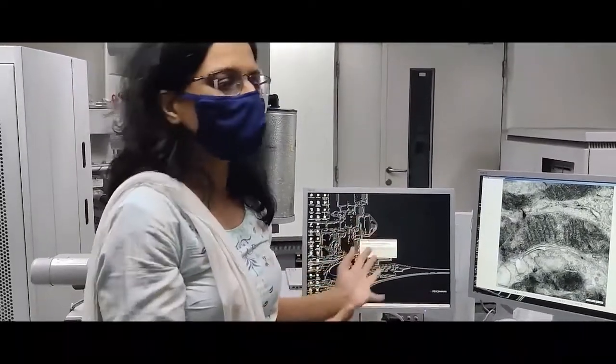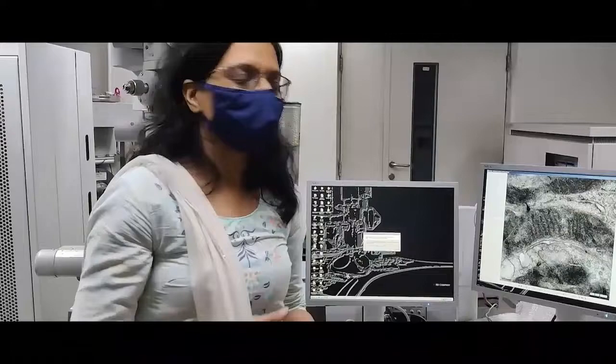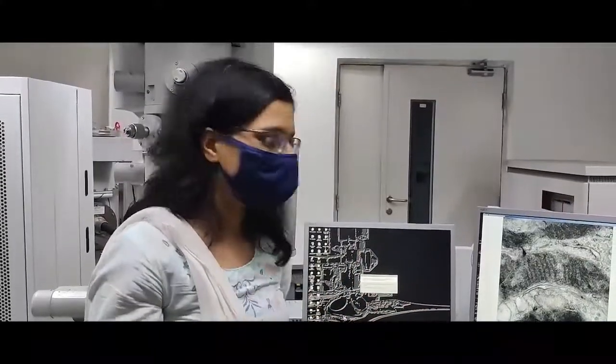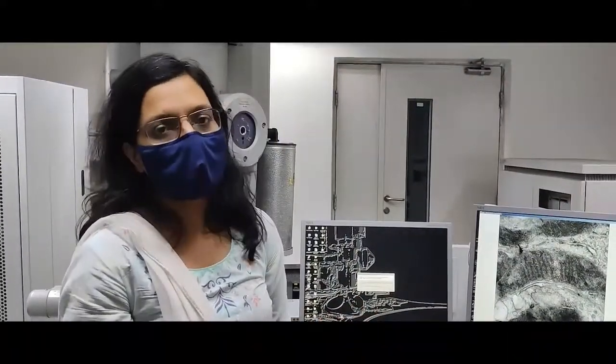Even at a very small magnification, in terms of TEM I am talking it is a small magnification, you can see that even at 5000x, you are able to see each and every cristae of the mitochondria beautifully. So, you don't really need 700,000x for everything. For very very small objects, like for example viruses, we may need to go up to 700,000x. But for most of the routine cell biology stuff that we see in the cells, the mitochondria, or the Golgi, etc., they all can be visualized at less than 5000x.